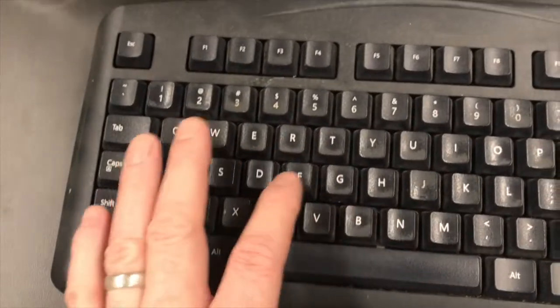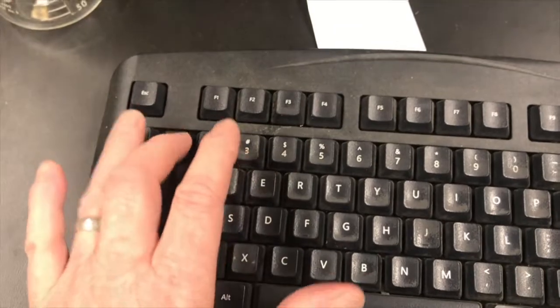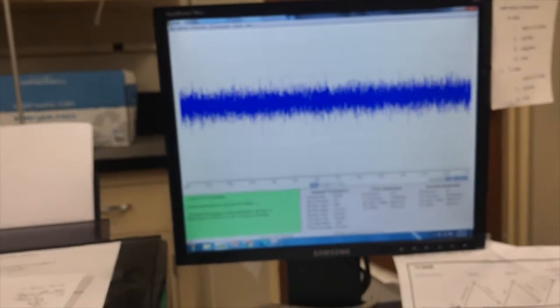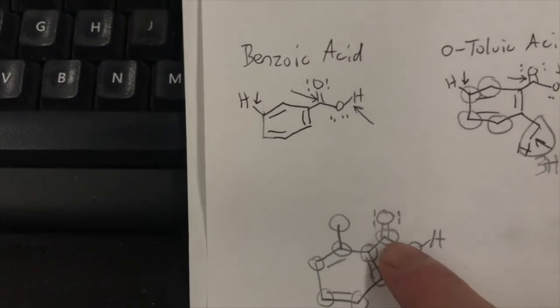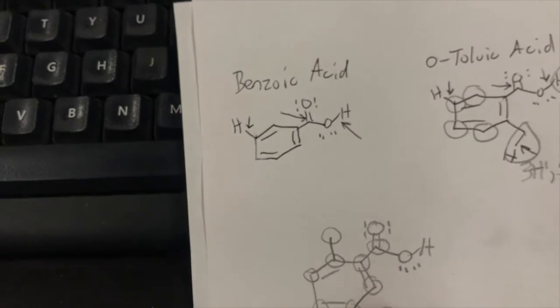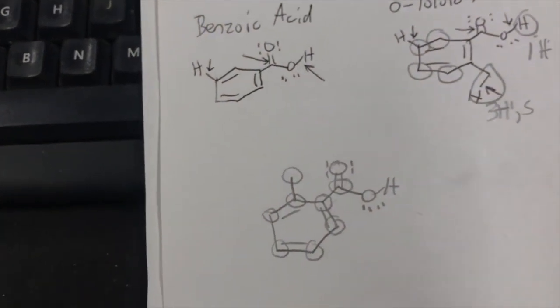So I type NU space C13. Enter, and it's in the carbon setting now. You can see it. Now I will scan it. ZG, enter. And I'm just doing the default 12 scans. I'm thinking that'll be enough, that I'll be able to see all 8 carbon signals: the carbonyl about 175, the methyl 25-30, and then the 6 aromatics from 150 to 100-ish.